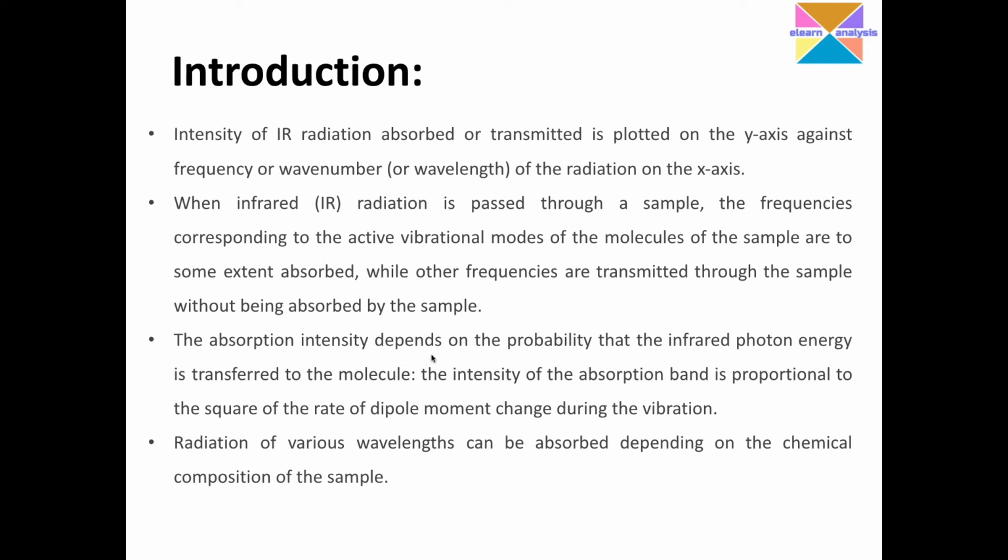And the absorption intensity depends on the probability that the infrared photon energy is transferred to the molecule. The intensity of the absorption band is proportional to the square of the rate of dipole moment change during the vibration.